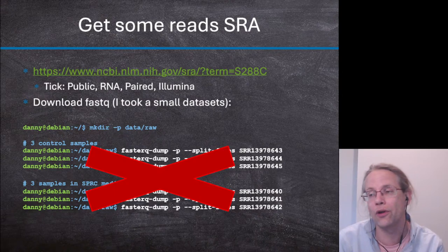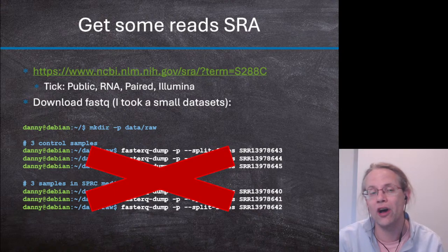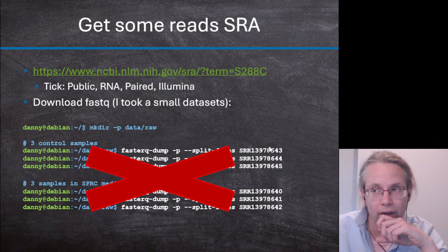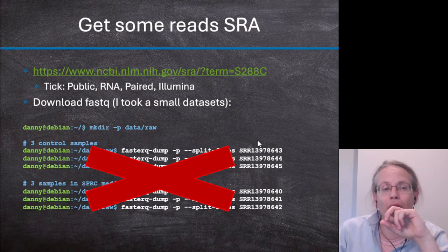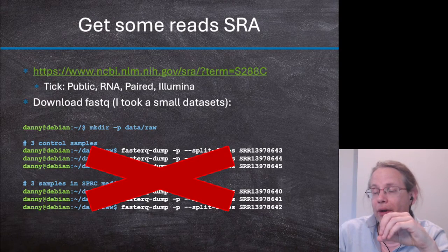It's the same as downloading all of the chromosomes. We could have just said wget, type in the whole address or copy paste in the address, but then we had to do that 16 times. And it's much better to make a small script to do that for you. So in this case, we're also going to do that. We're not going to type into the command line anymore. We're just going to use R and have R execute or generate the correct commands for us and then execute them.